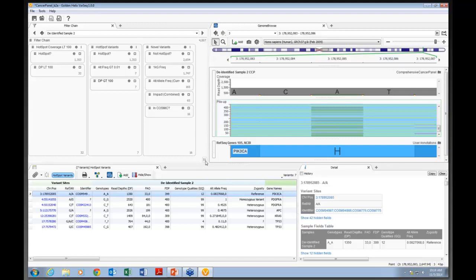And down at the bottom, this number 55 is the total set of variants that are passing through all of the selection criteria that are outlined in these three separate windows. So each of these vertical stacks of boxes contains a workflow outline.